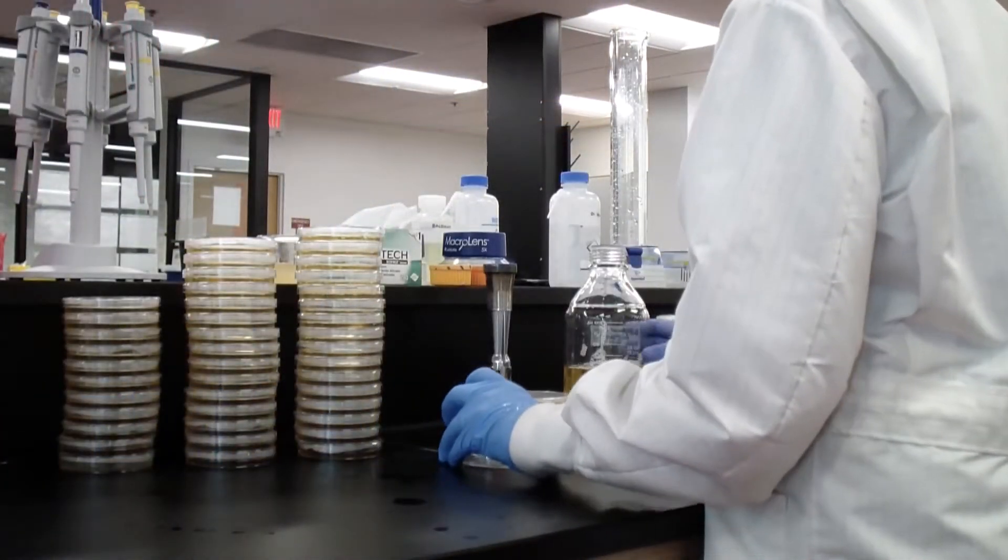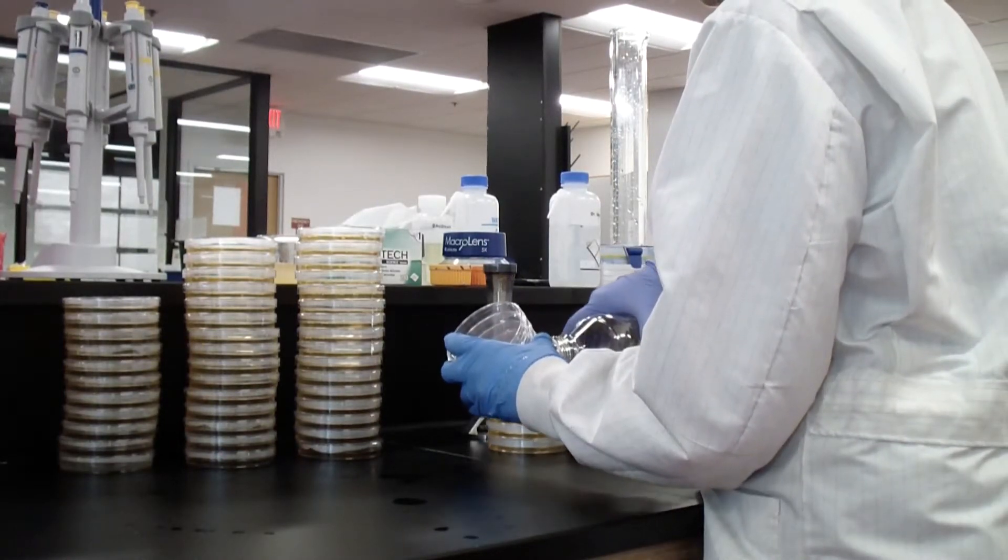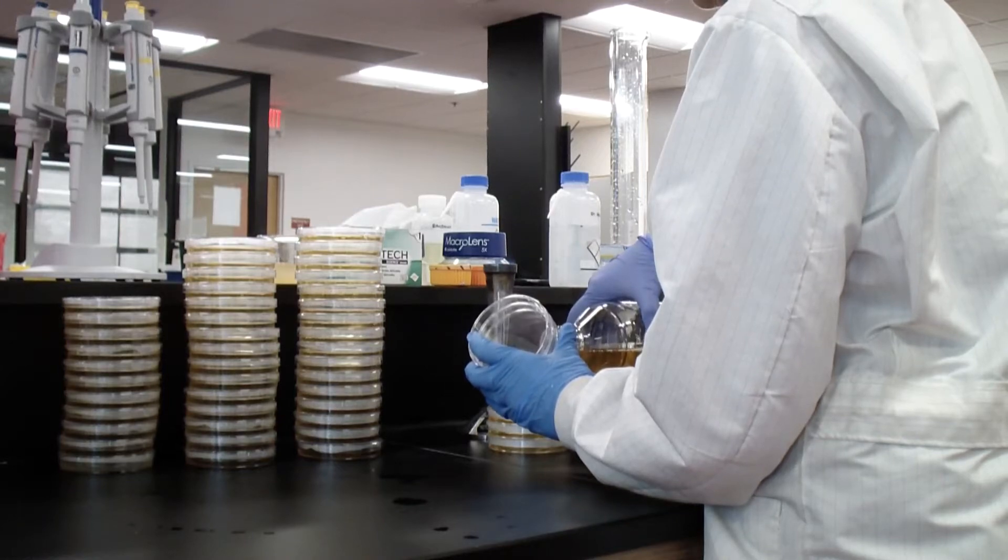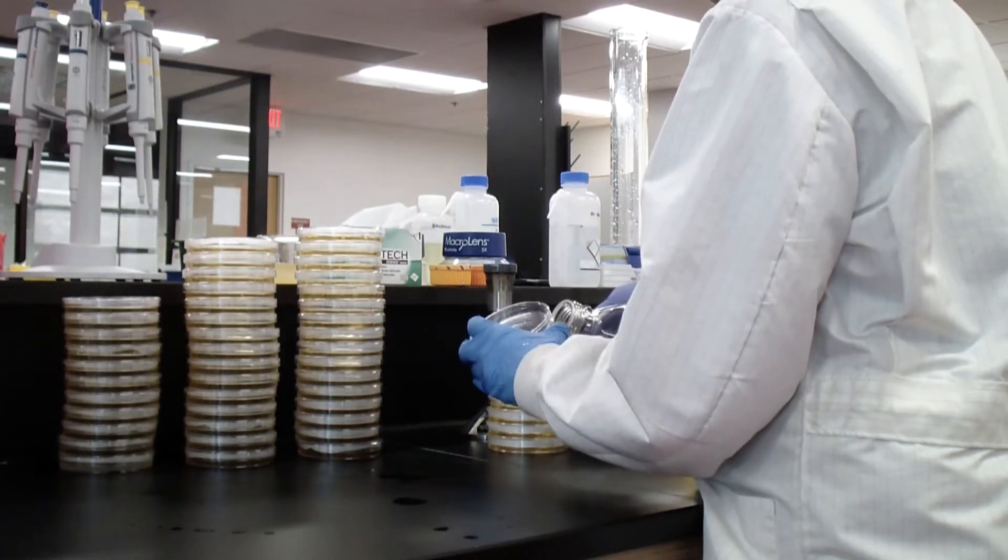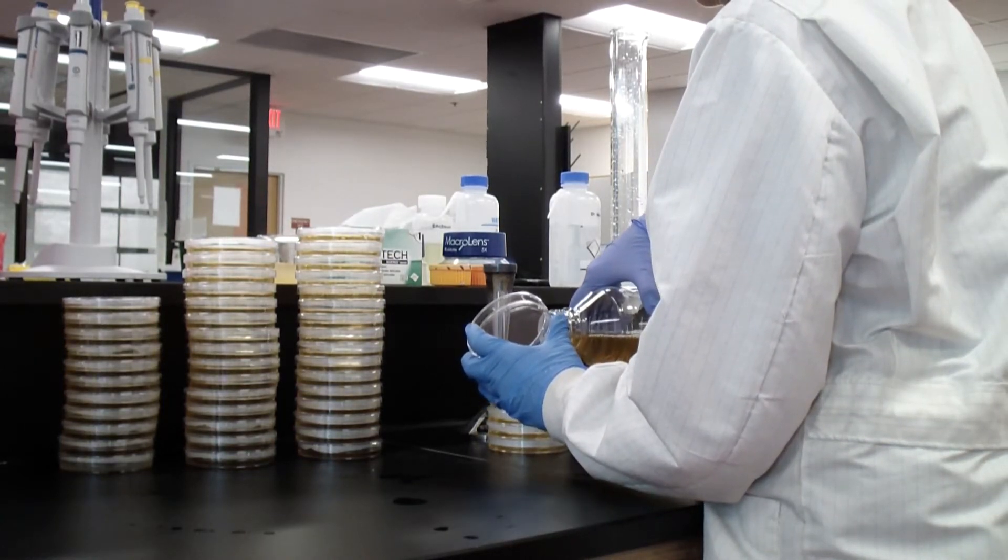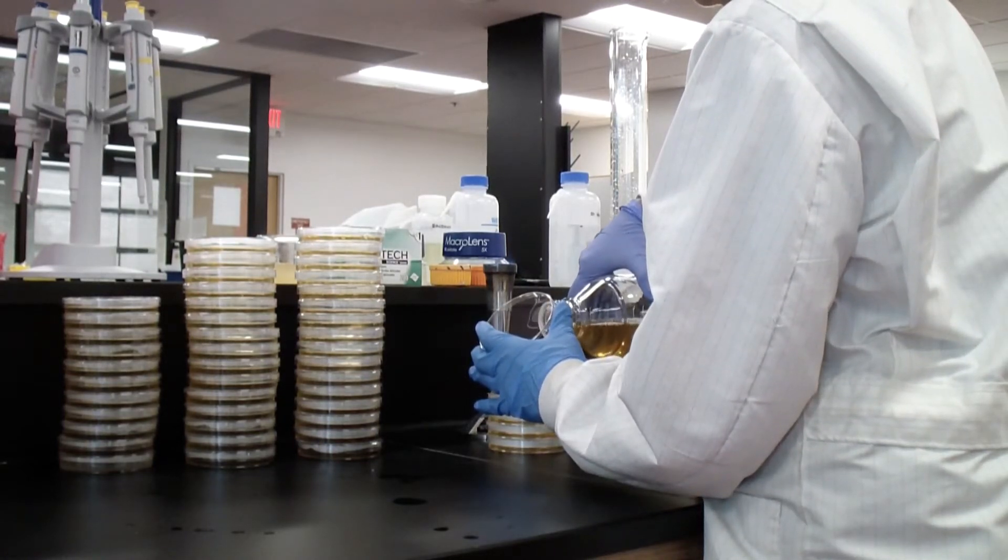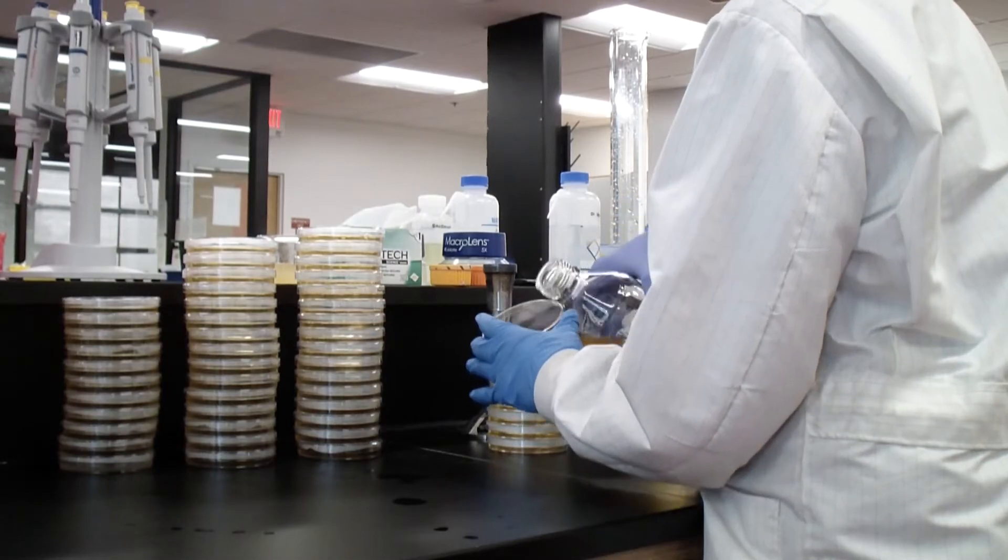Once the media has cooled down enough to handle the bottle while still being liquid, the media is poured into sterile Petri dishes working close to a flame to make sure that the media does not get contaminated. We stack the warm plates on top of each other to limit the amount of condensation that forms in the plate.